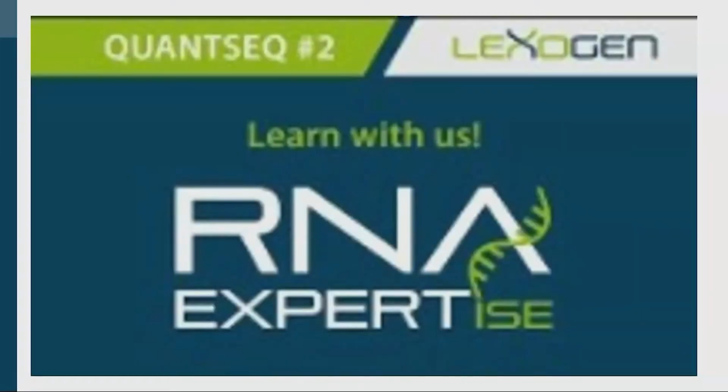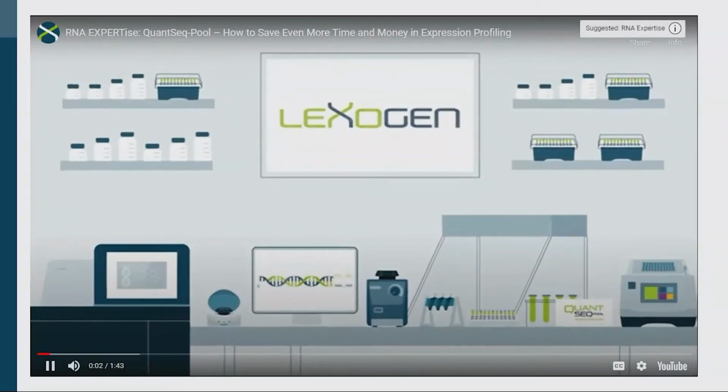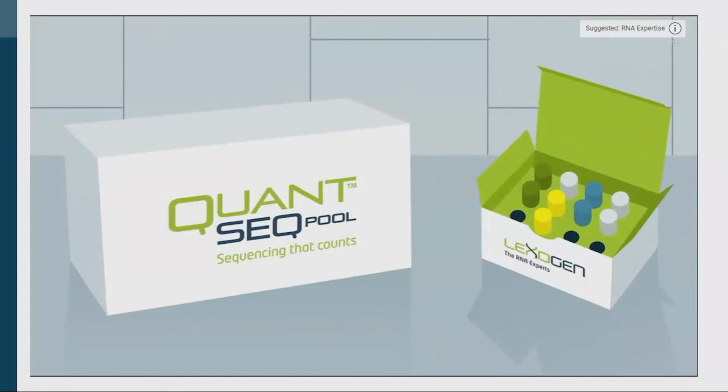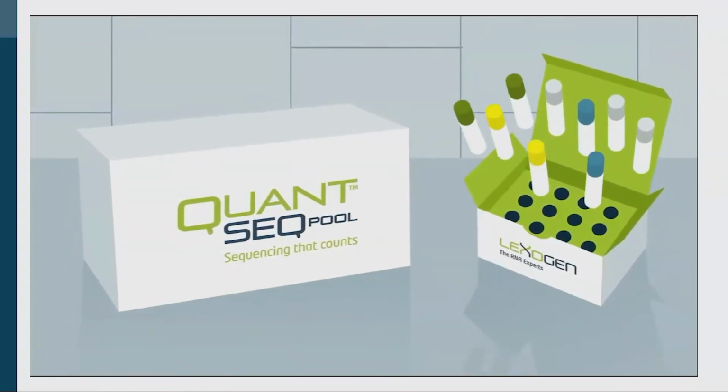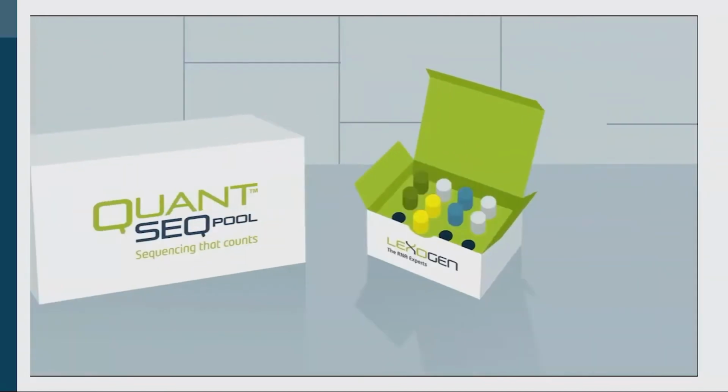As with QuantSeq, I want to start by showing a quick video which provides an overview of QuantSeq-Pool.